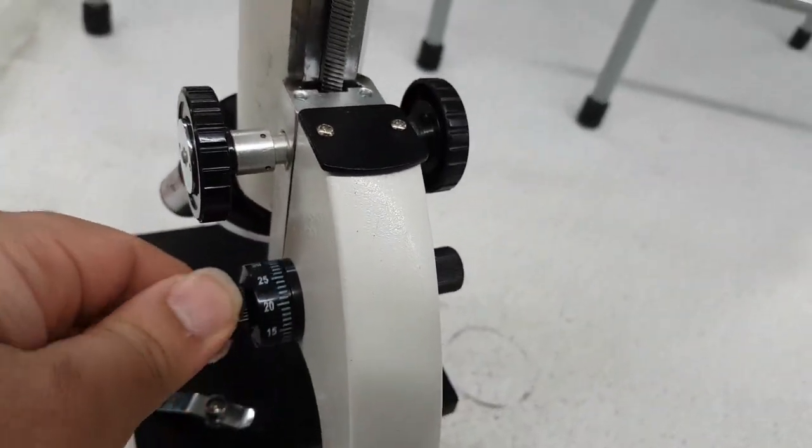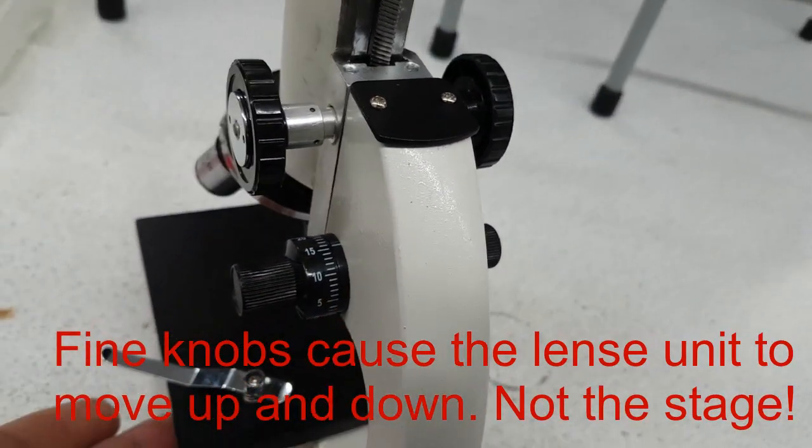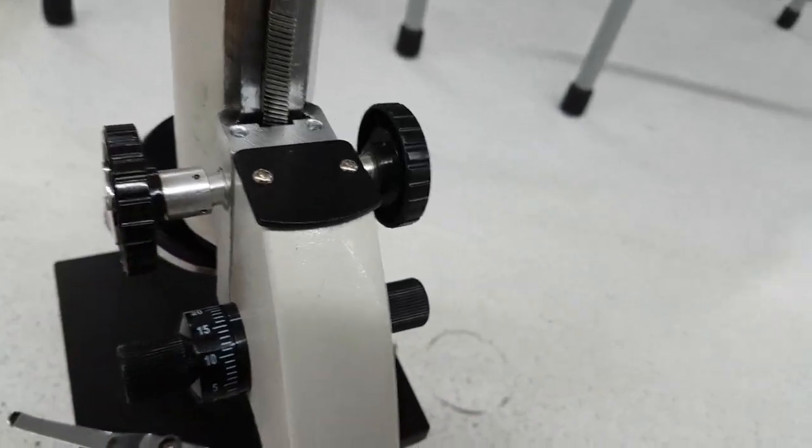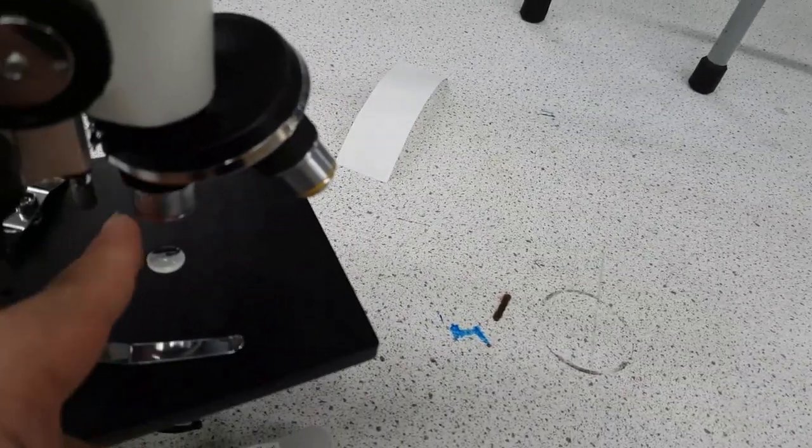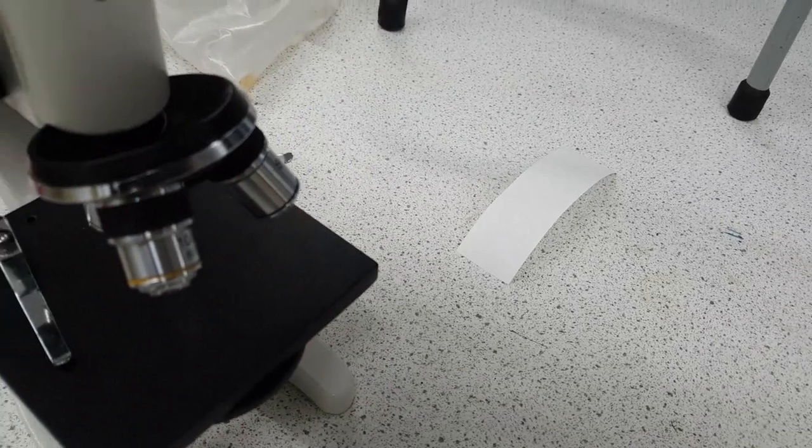And then finally you have the fine adjustment or the fine knobs which you move slowly and it causes just tiny amount of movement within the stage. Now the coarse knobs you use with the low magnification objective lens and the fine knobs you use with the other two objective lenses.